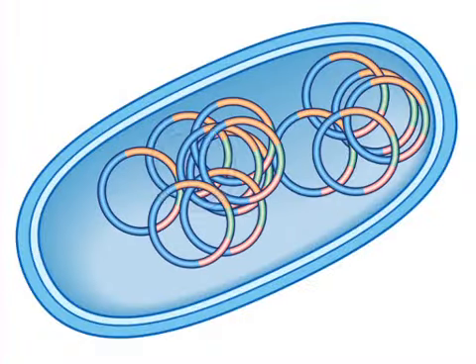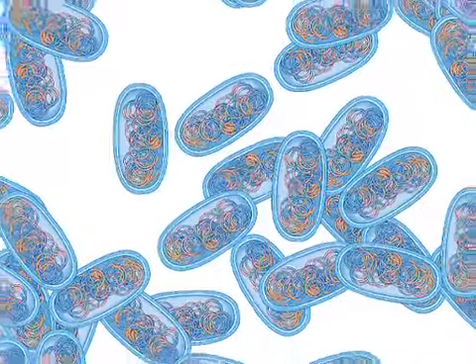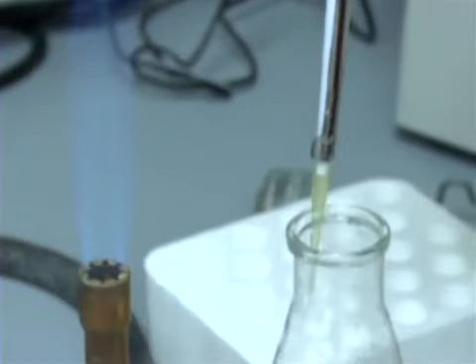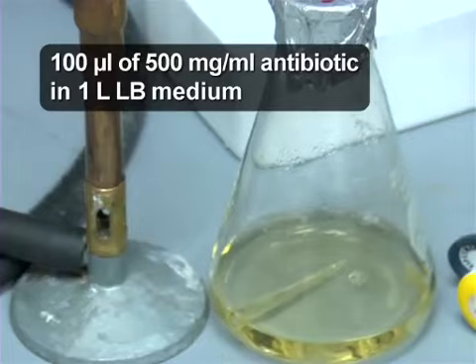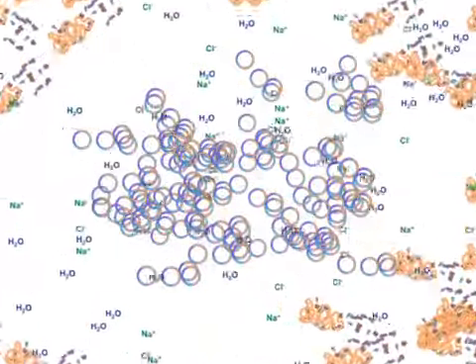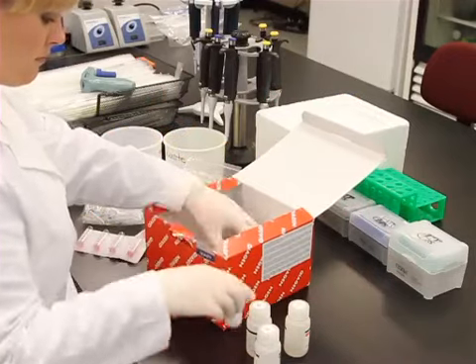In most transformation experiments, the goal is to get rapidly dividing bacteria to make large quantities of your plasmid, which includes your target gene. Following bacterial transformation, the next step is to grow up large quantities of the bacteria in antibiotic-containing liquid medium and perform plasmid purification, which, as its name suggests, involves purifying the plasmids from bacteria. Many commercial kits are available for this purpose.